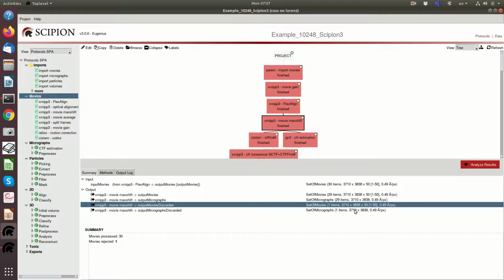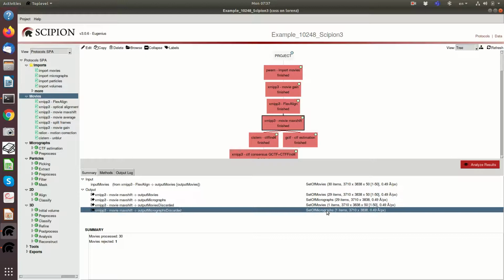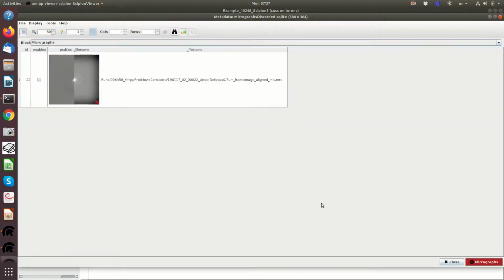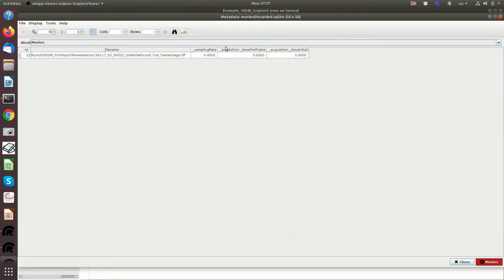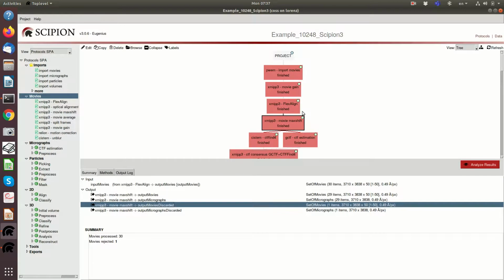And we can see why this one didn't. So for instance, if we analyze this one, or maybe it is here. No, we cannot see it, this shift estimation is not propagated, but one of them didn't meet this maximum frame shift.